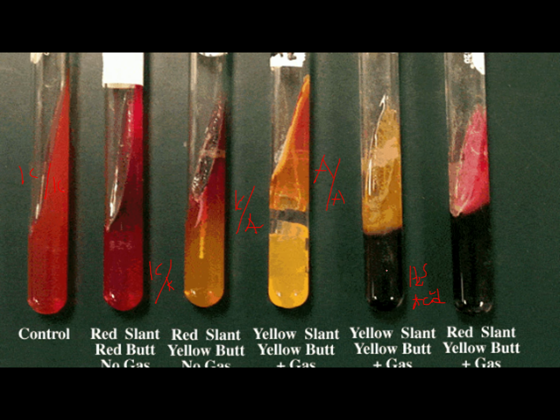Whenever there will be blackening of the media, you report that as yellow or A. So you would report it as A over A with H2S production. And there's also cracking, so positive din sa gas. While this one, red alkaline siya, K over A, with hydrogen sulfide and gas production. So that's how you read your TSI.